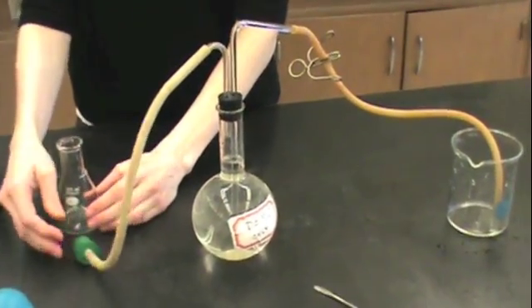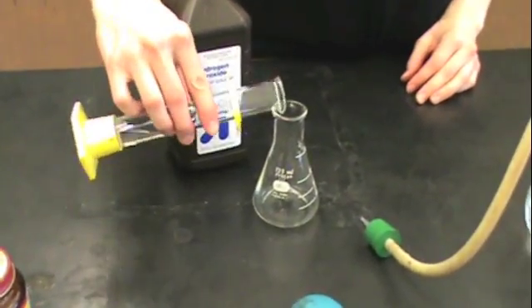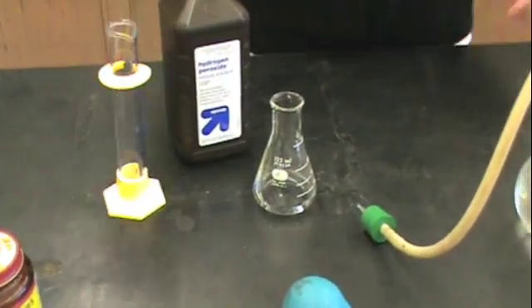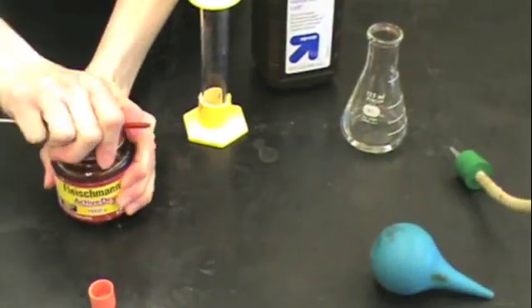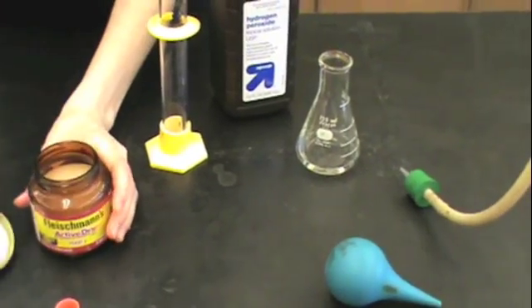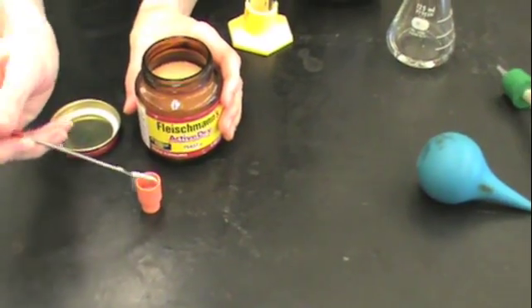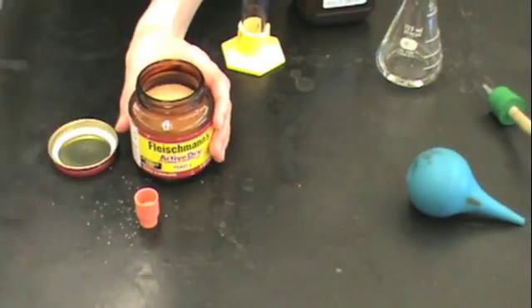Replace the pinch clamp, and now you can weigh out your Erlenmeyer flask and add about 16 mils of hydrogen peroxide to this flask. You will then obtain a red stopper and some yeast and add enough yeast to the stopper to just cover the top of the stopper. It doesn't have to be an exact amount. It's usually one or two scoops of yeast.